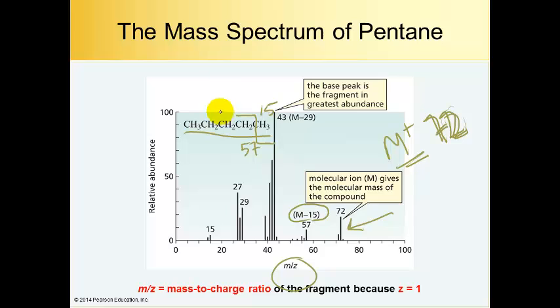Now, if we take the cut here, instead of 15 this mass would in fact be 29, right? So it's 12 plus 3 plus 12 plus 2, 29. And then the bottom piece, this 3-carbon piece, would have a molar mass of 43. So here's the peak right there. And that peak is going to be the molecular ion minus 29, because this piece broke off, and then that piece is what is shown in the detector.